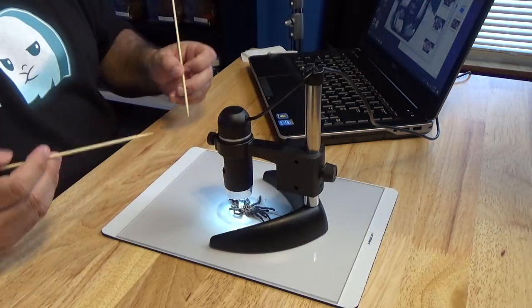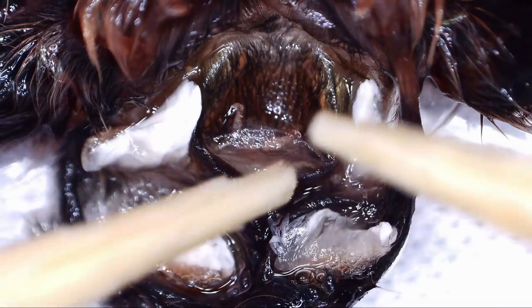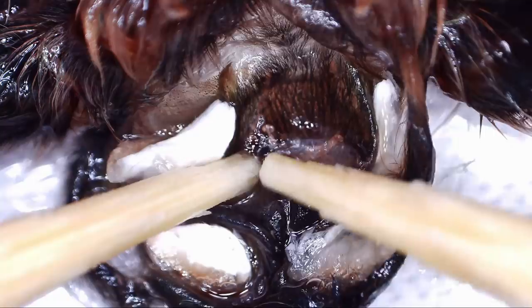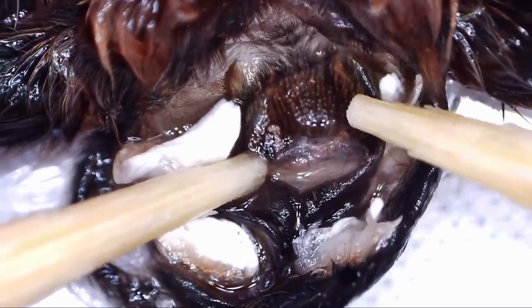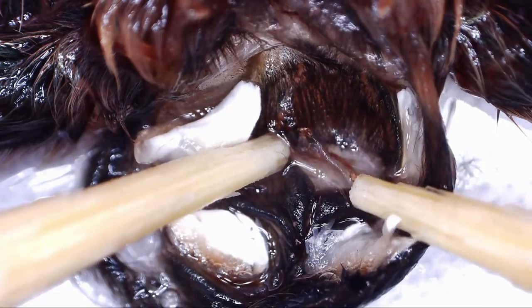I had yet a third Diplothele diamantinensis that molted recently. So I figured I'd put this one on here as well. It's already spread out — give you a moment to determine whether it's male or female. And if you said female, you are correct. You can see the spermatheca right there — they look like little bunny ears. There's one sticking out here and another one that's not quite sticking out, might just have gotten stuck back a little bit because it was dried out. You can clearly see it right there — a long little bunny ear stuck behind the uterus externus. So it does appear that she is sclerotized and ready to breed.